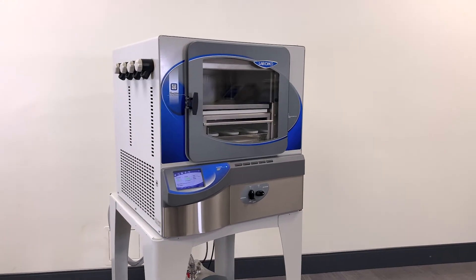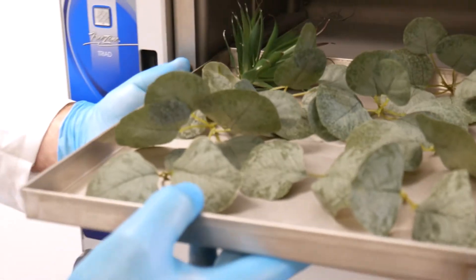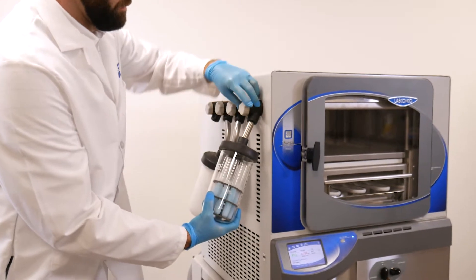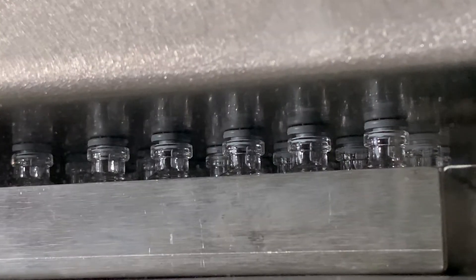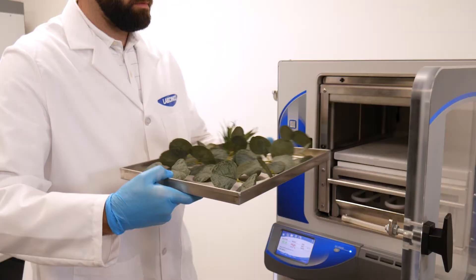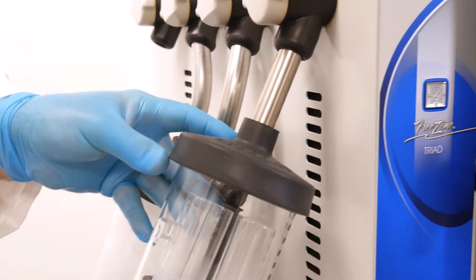Freezone Triad freeze dryers can handle the widest variety of samples, with the convenience of pre-freezing in the chamber and the flexibility of freeze drying aqueous or solvent samples in flasks or on stoppering shelves. With laboratory space at a premium, it's nice to have the flexibility and versatility to freeze dry many different sample types and forms with a single benchtop unit.